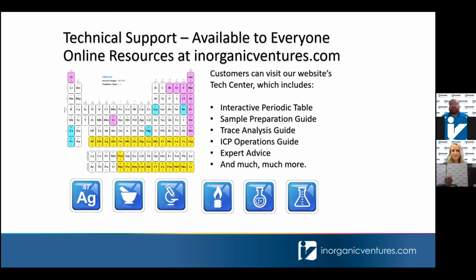If I could add just a little bit on that. Sure, yeah. I was real curious when the EPA came out with, I think, this very excellent approach for stabilizing mercury. By the way, I applaud them every time I look at the reference. It works very, very well, and we've seen published people say, "Well, the gold acts as a strong oxidizing agent." I think it also may form a di or even a triatomic molecule with the elemental mercury.